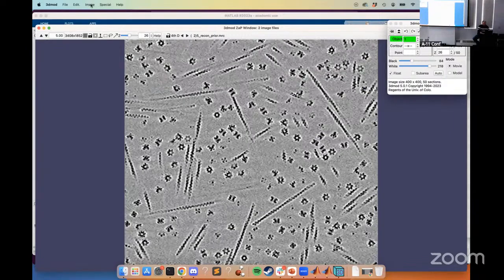All right. I think we covered virtually everything that I wanted to show you. The big thing left to do, when you have segmentations, is what do you do with them afterwards? One thing is to just put them in your paper, and they're really pretty and look nice. But the next part of our adventure is to try to do something meaningful with that data. And Dragonfly has tools for extracting things like coordinates, centroid coordinates of individual particles.